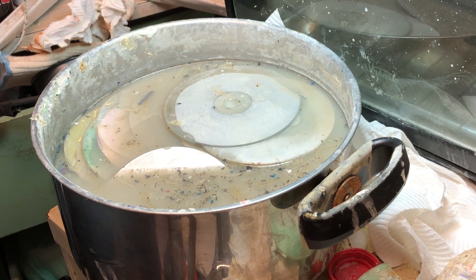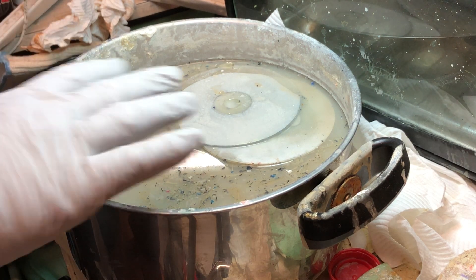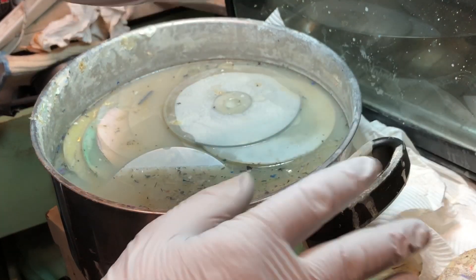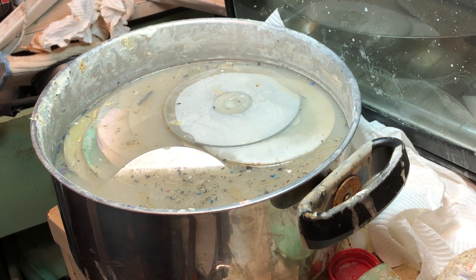G'day YouTube, welcome back to my little lab. This is my stainless steel bowl with sodium hydroxide and water. One thing I didn't mention last time - you should wear gloves, play safe, read the contents, and know what you're doing. If you don't know what you're doing, don't do it.